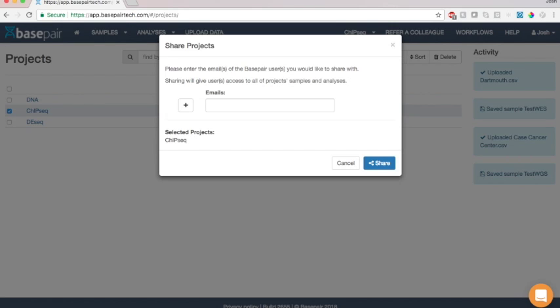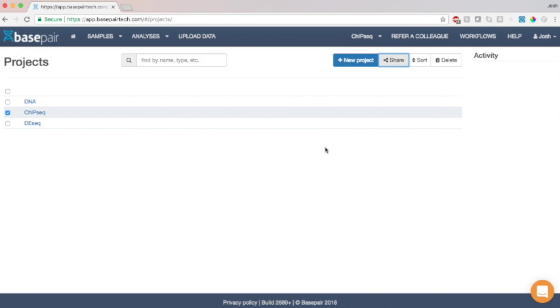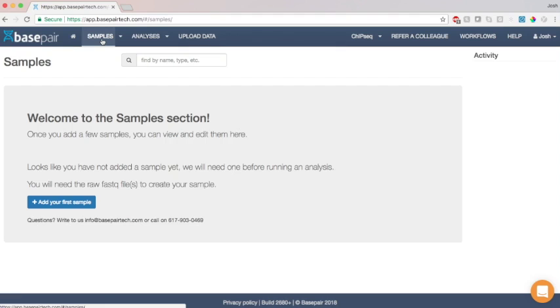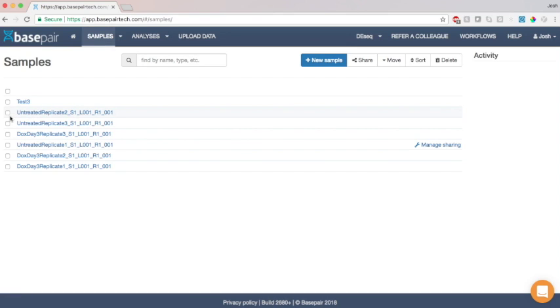Finally, you can also move samples in between different projects. To do so, access the project which has samples you wish to move. You'll notice that if there are no samples, we won't be able to do that. Once there, simply click the samples you wish to move. Click the checkboxes and click the Move drop-down. You'll be able to select any other current projects that you have to move the samples into.